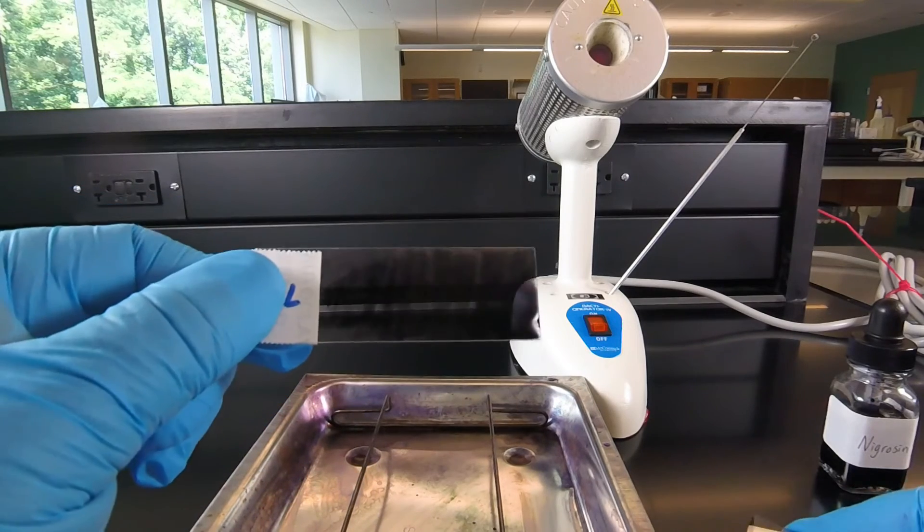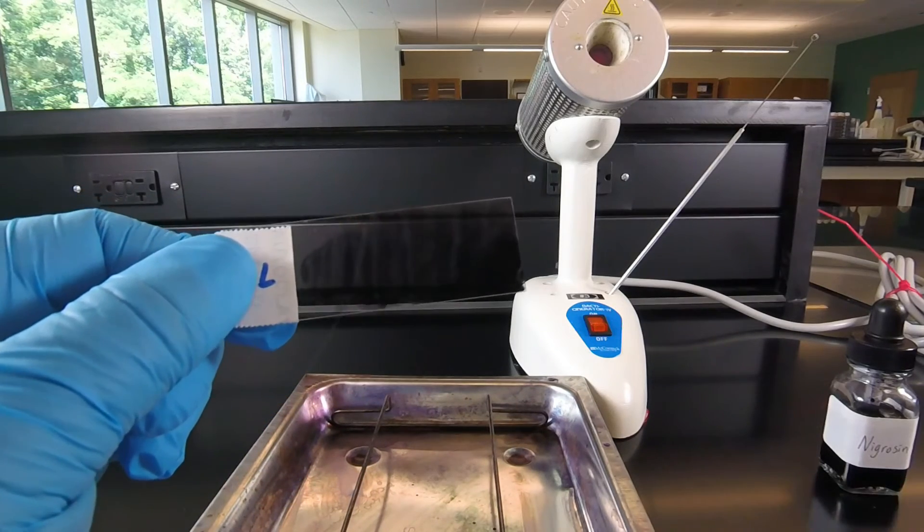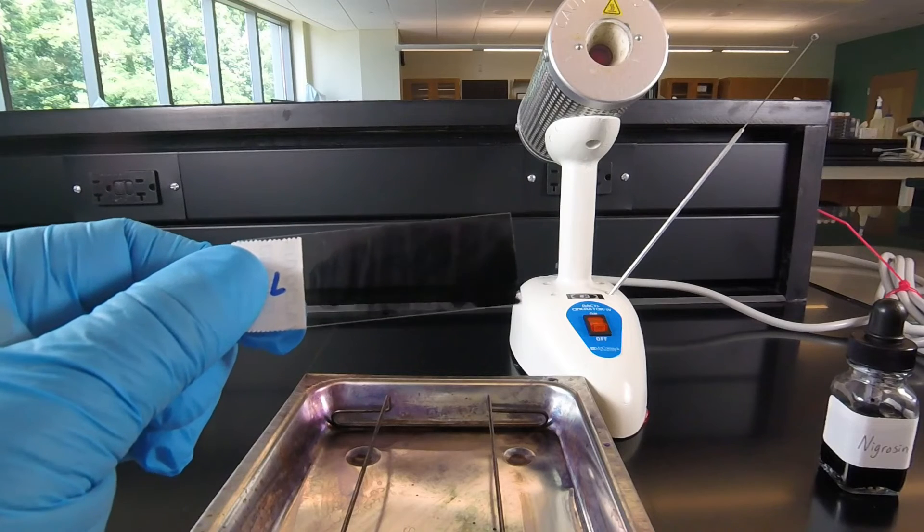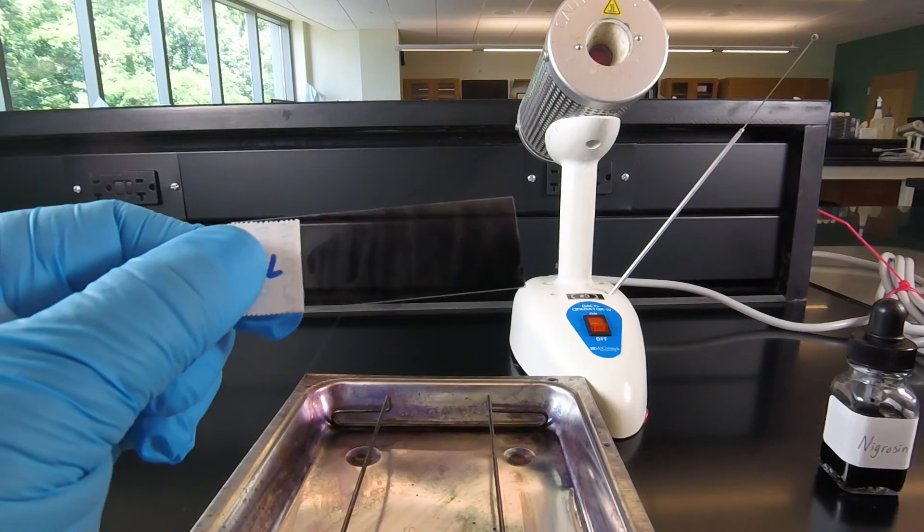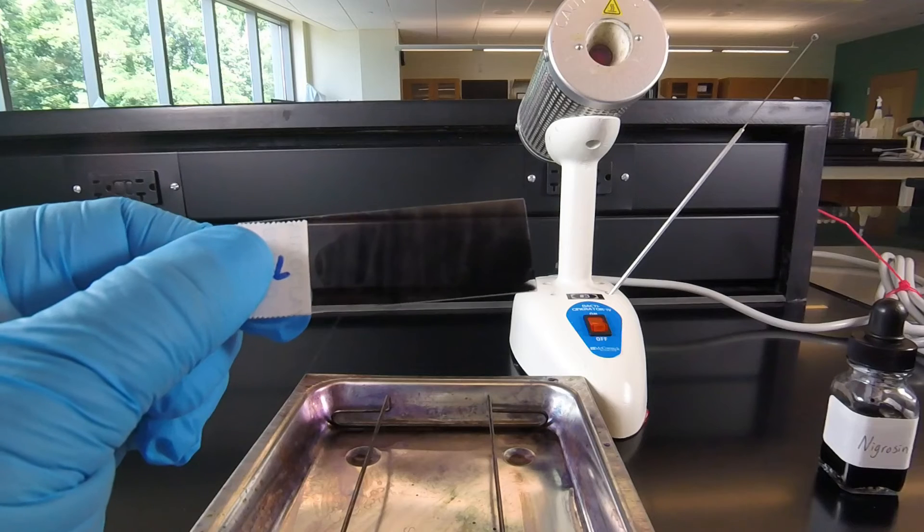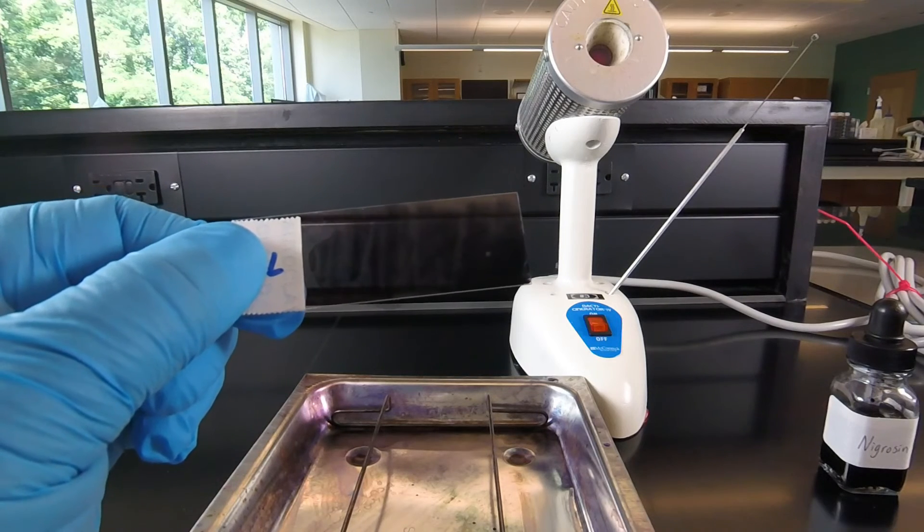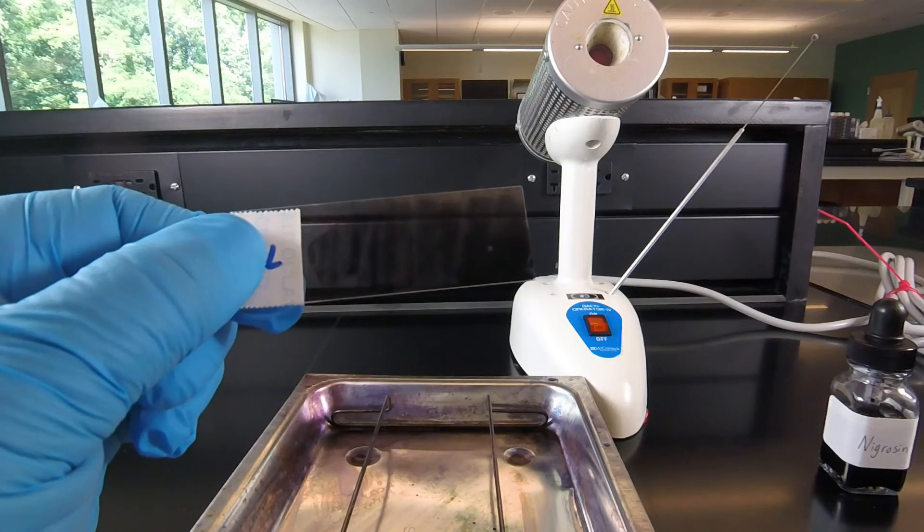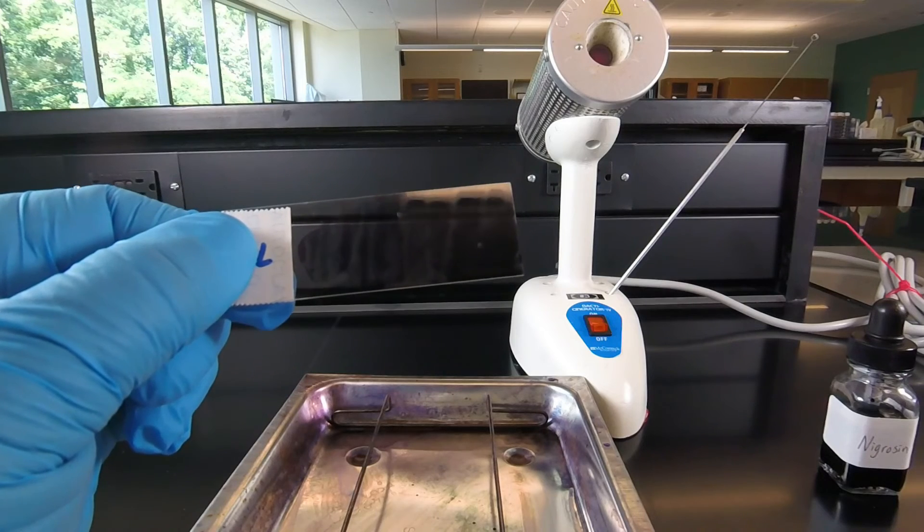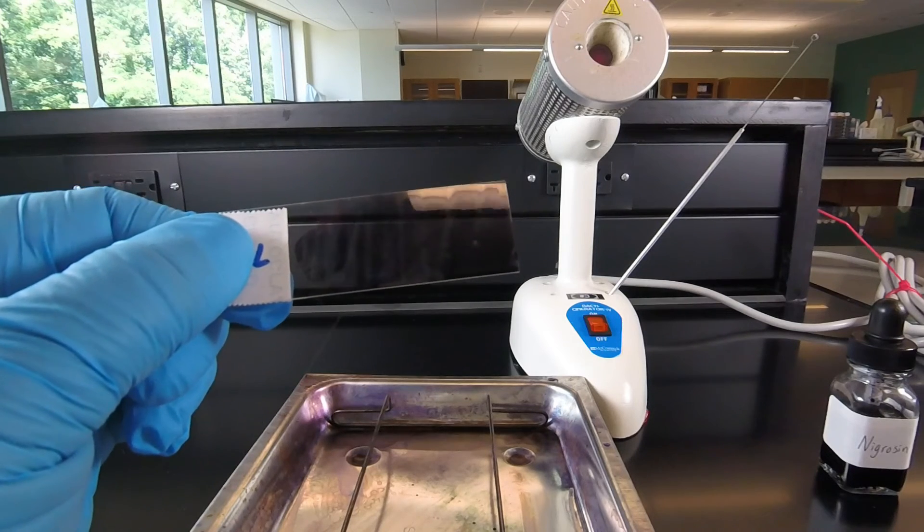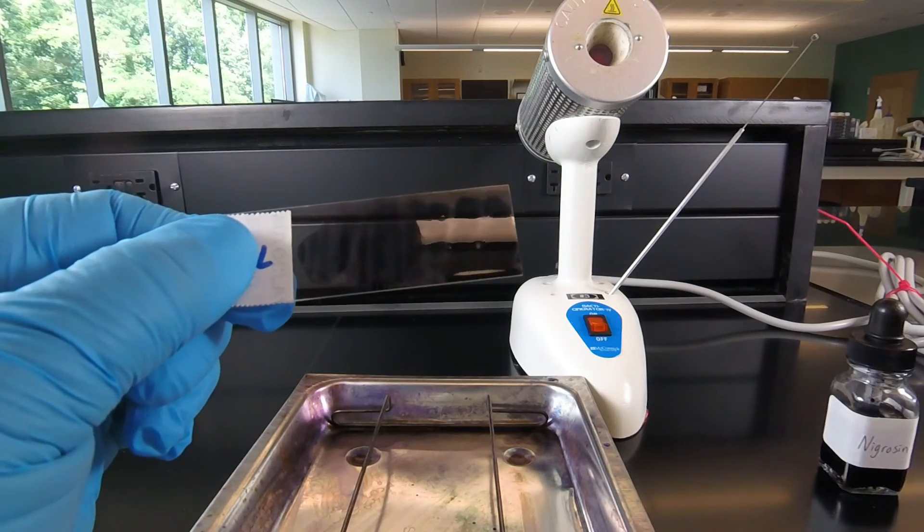And what we're looking for are alternating light and dark areas on the slide. We'll be looking for an area that's kind of in between. If the slide is too light in color, we won't see any contrast between the organism and the background. If the dye is too thick, then we're not going to be able to see through the dye.